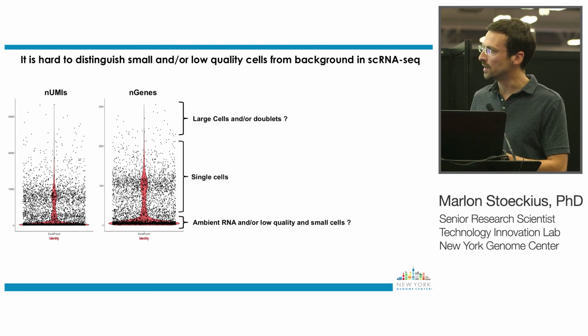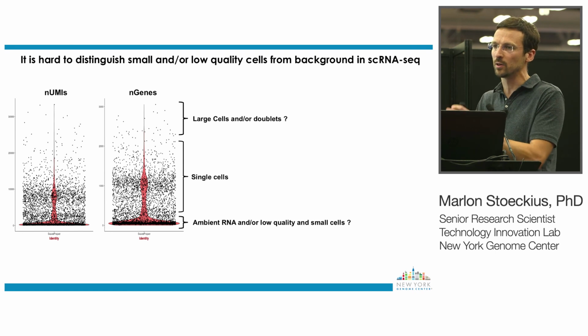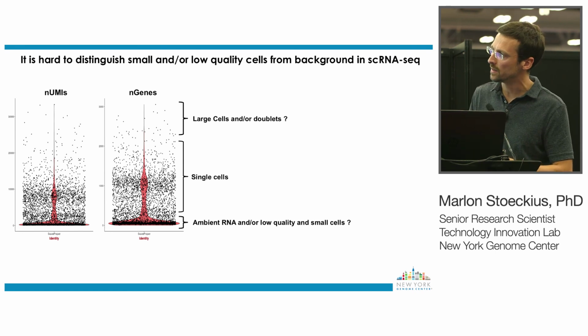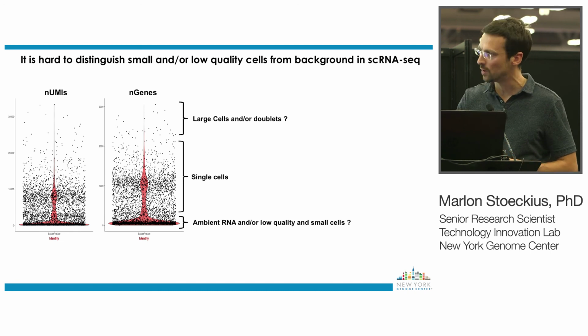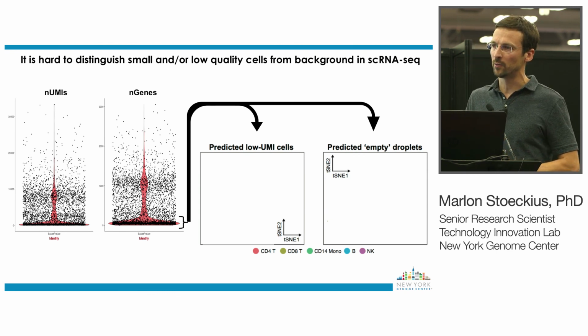But it could also be that there are a few very small cells which have only very few genes expressed, or which we don't sequence very deeply, or maybe bad quality cells that are in this range, that we could somehow filter out if we had this additional cell surface marker information. And we do. Since we have this cell hashing surface marker, we can now pick out cells that have very specific signal for one of those cell surface hashes.